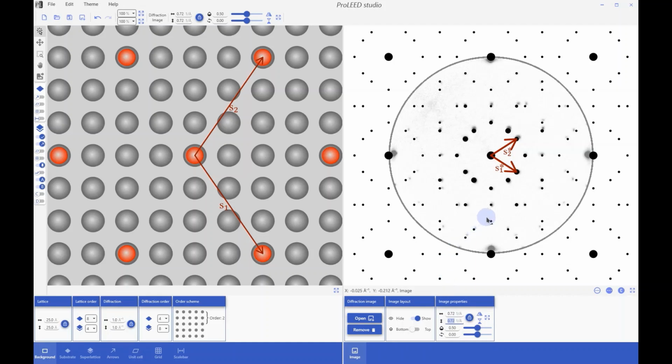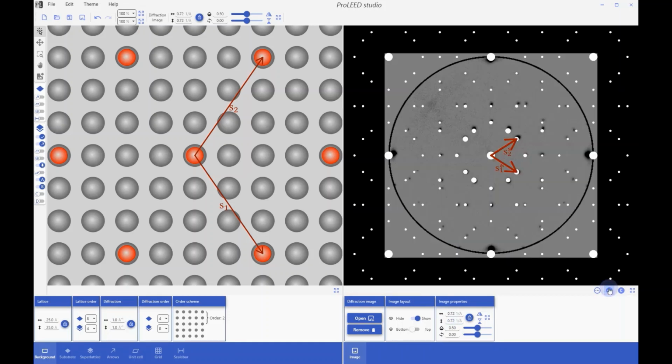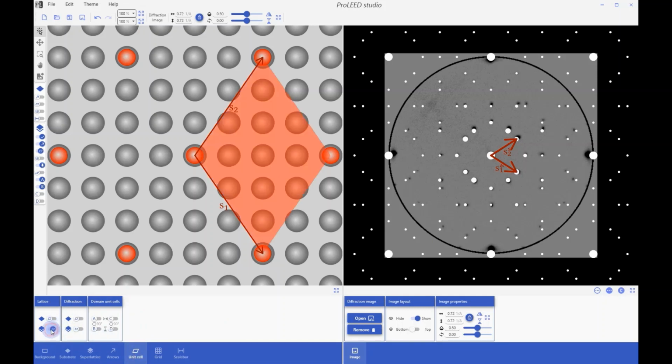Slight imperfections here are caused by diffraction image distortions, so it's always good to compare mutual positions of diffraction pattern at specific places. The reason of modeling of diffraction pattern is of course to get real space lattice arrangement, so we can now visualize the lattice unit cell.